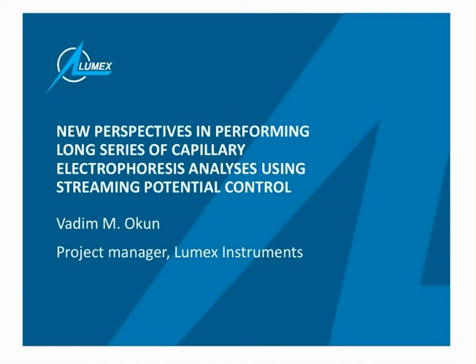The actual laboratory should have several techniques in order to cover all the possible applications, in order to get money, or get projects, or fulfill the requirements of their customers. So capillary electrophoresis is definitely one of the most powerful techniques which should be present in each lab.